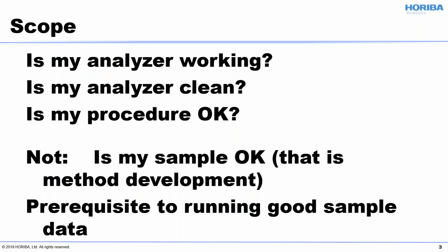I'll give you an example from one of our customers in the pharma industry. They would verify their analyzer before every set of measurements for drug release. It turns out they were doing this because they were sharing the analyzer with the R&D group. And sometimes the R&D group would leave extra particles in the analyzer. This was one way to make sure that their measurements on the drug products were correct and no one messed things up in between production campaigns. So, like I said, most of the time this is pretty boring. It's a great way to have confidence in your data or where you're getting started.